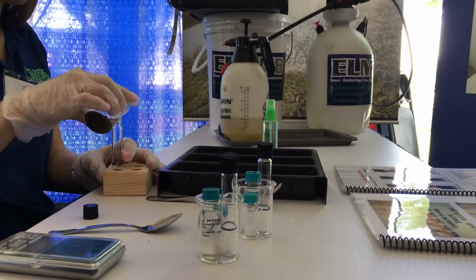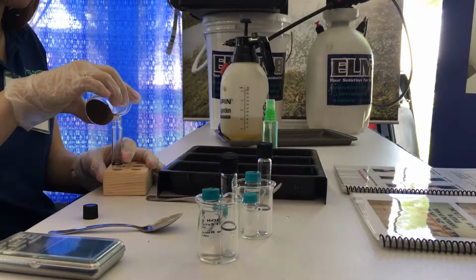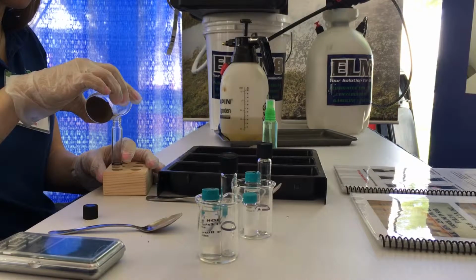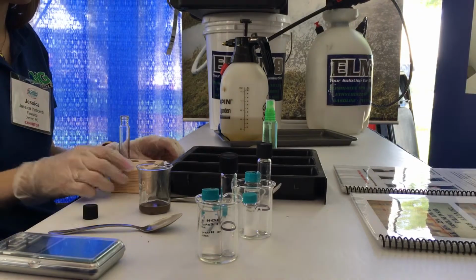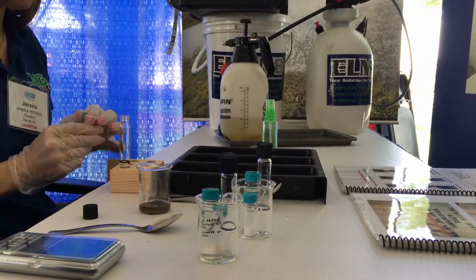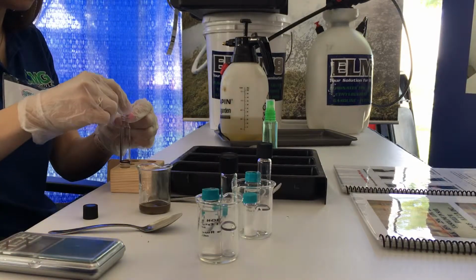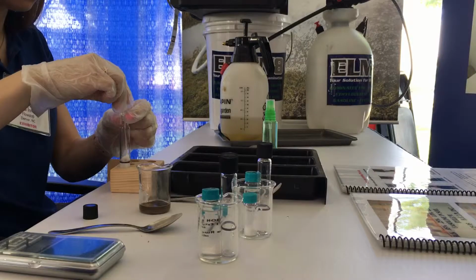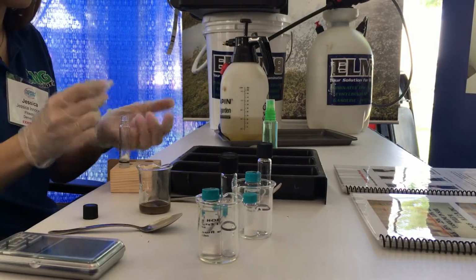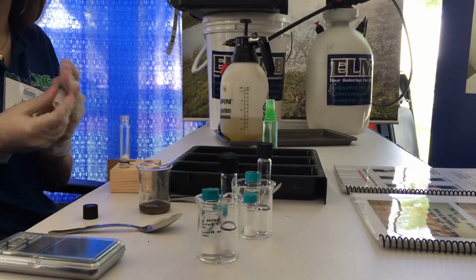So you measure out your 5 grams, you put your extract solvent in there, you stir it around. When you stir it around, you're increasing the surface contact of the solvent with the contaminant in the soil and pulling the contaminant into the solvent. Now the next step is to decant that off from the beaker into the test tube up to the scribe line. And now we're going to add our color development reagent catalyst, which is stark white. White represents 0. If there's any hydrocarbon contamination in that solvent whatsoever, as soon as that white powder hits that solvent, boom, color pops. It's how fast the chemistry works.